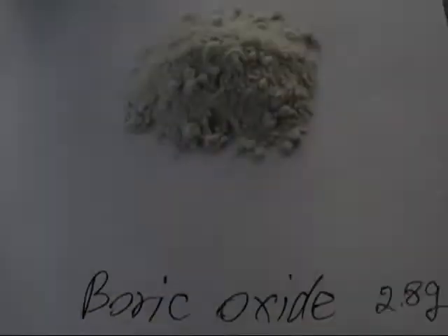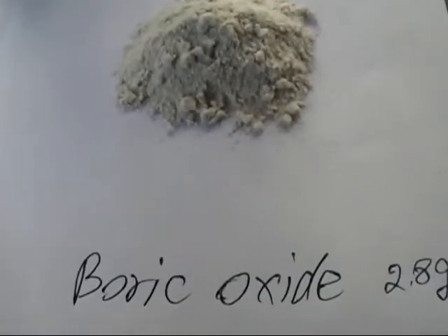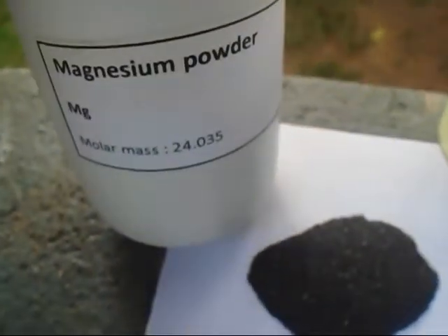After the reaction, I powdered the boric oxide. Now I have 2.8 grams of boric oxide. I mix an equal amount of magnesium powder — this is magnesium powder — and also a little bit of sulfur. I'm going to mix these chemicals together.